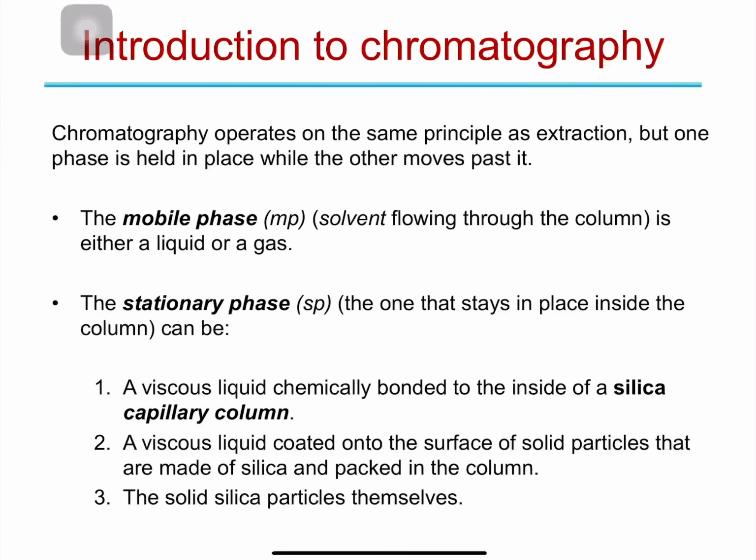So let's move now to talk about chromatography. Chromatography operates on the same principle as extraction. And when I'm talking about extraction, I mean both types of extraction, the liquid-liquid extraction and the solid phase extraction. So in chromatography, we have two phases, a stationary phase and a mobile phase. And because I said it applies the same principles in both liquid-liquid extraction and solid phase extraction, that means that our stationary phase is not always a solid.